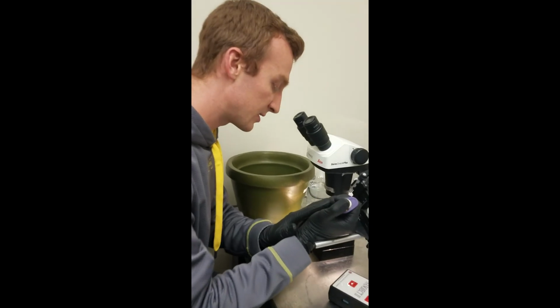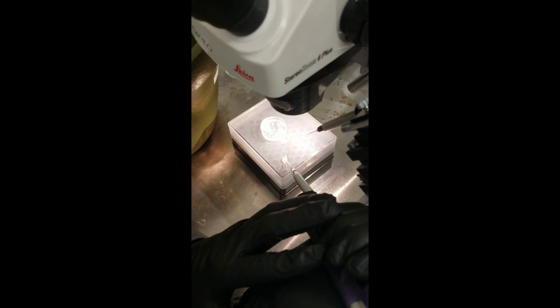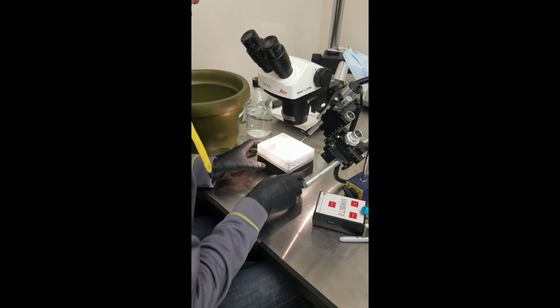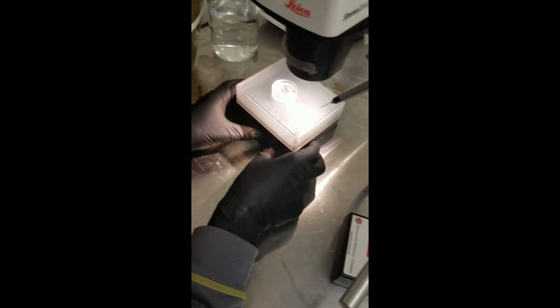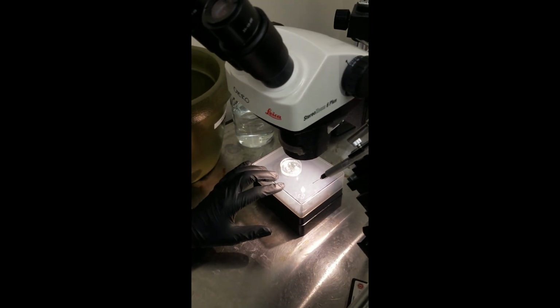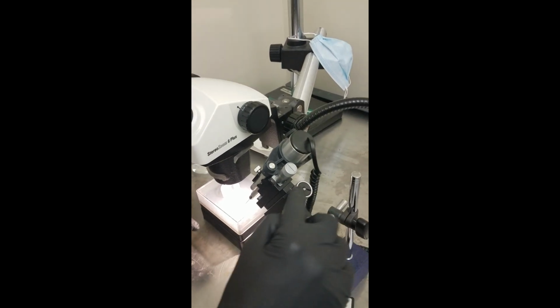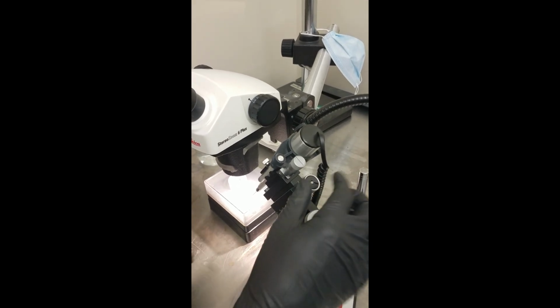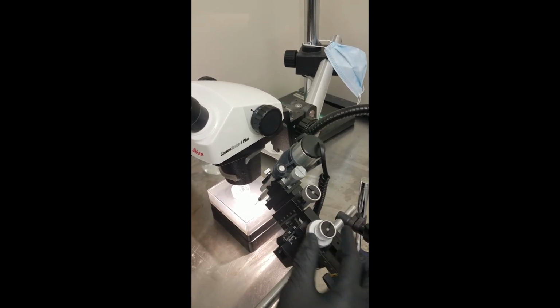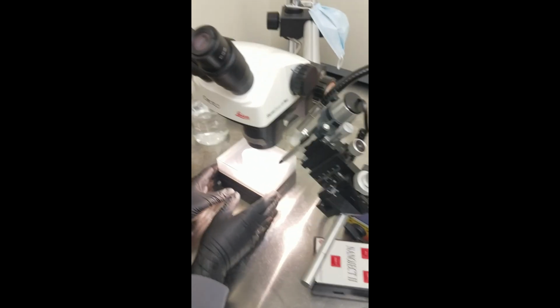Dispense the RNA into this lid that we just got earlier. Make sure that you get all of it out of your micropipetter. And then before this RNA is exposed for too long, now we need to draw it up into our glass needle. So this knob moves your needle straight down. This knob will move it up and down, like that, in this way. This one moves it side to side, and this one moves it forward and backward. So between those things, and you can always move the platform itself.